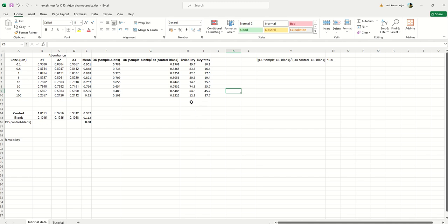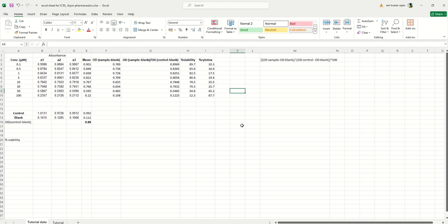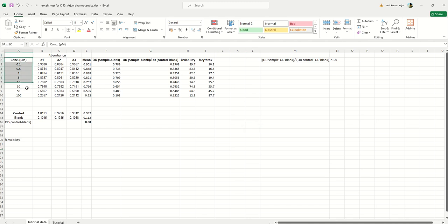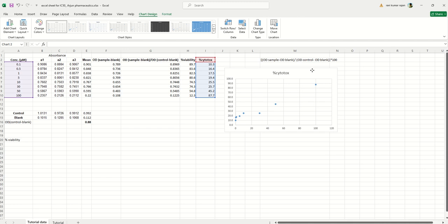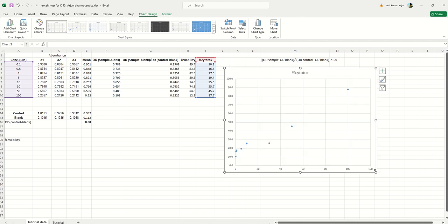Now we can calculate the IC50 value. IC50 means the concentration at which 50% of the population has died — that is, 50% cytotoxicity. Here, the response is your percentage cytotoxicity and you also have the concentration. To calculate IC50, first select these two columns — concentration and percentage cytotoxicity — and create a scatter plot in Excel.